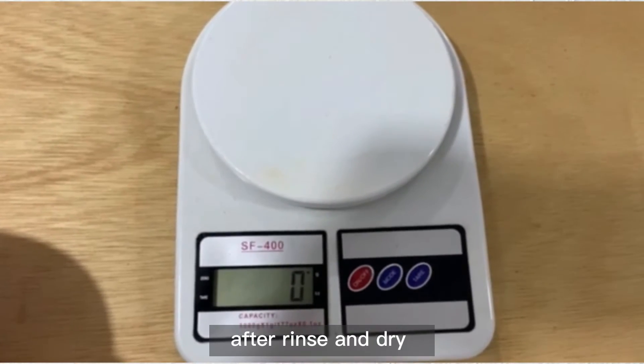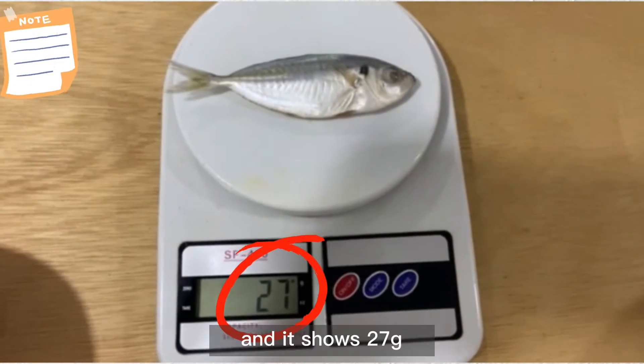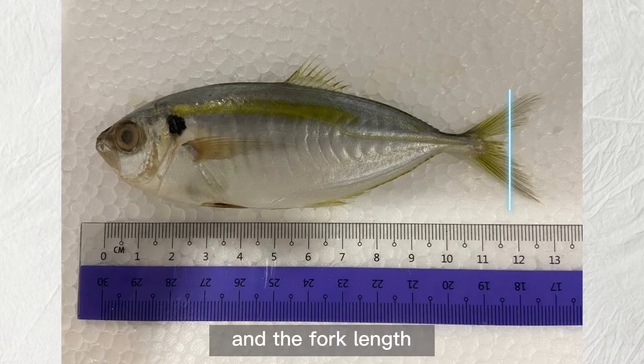After rinsing and drying your specimen, you will need to weigh it first. It shows 27g. Next, you need to measure the total length and the fork length.